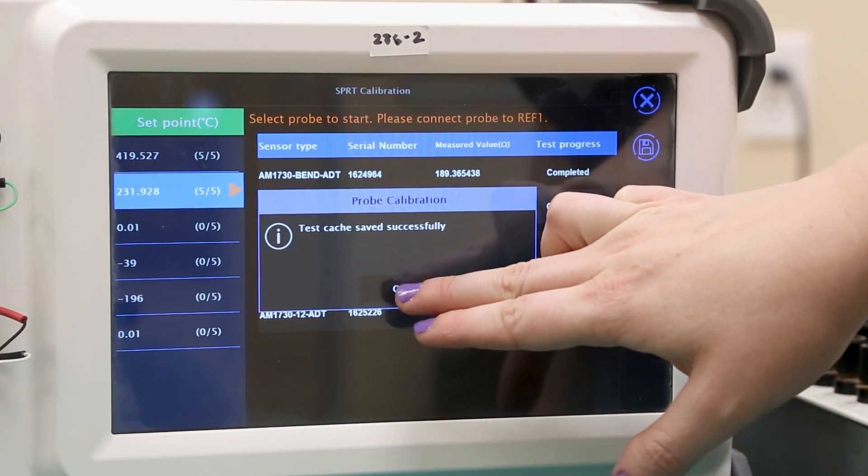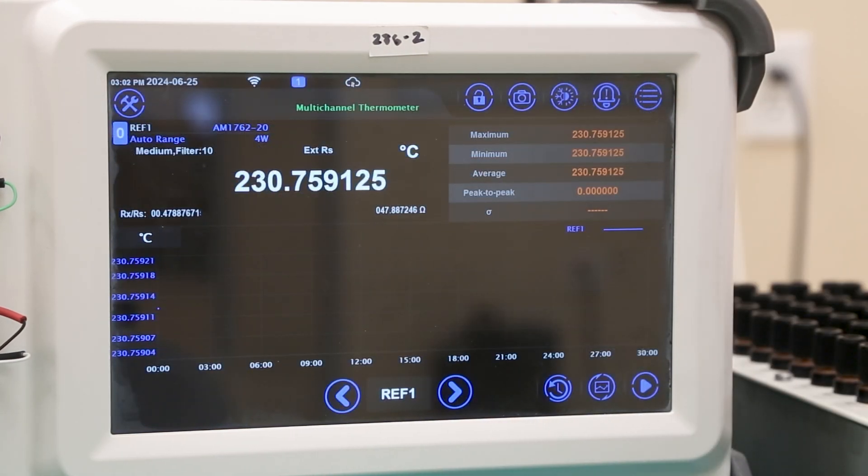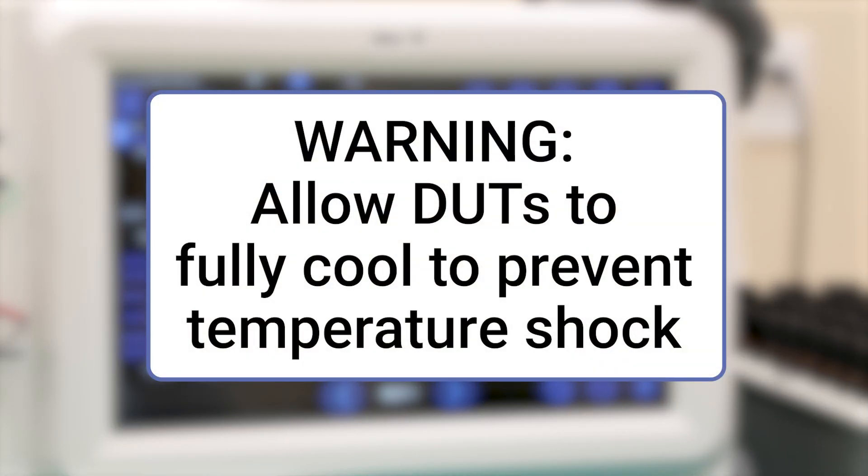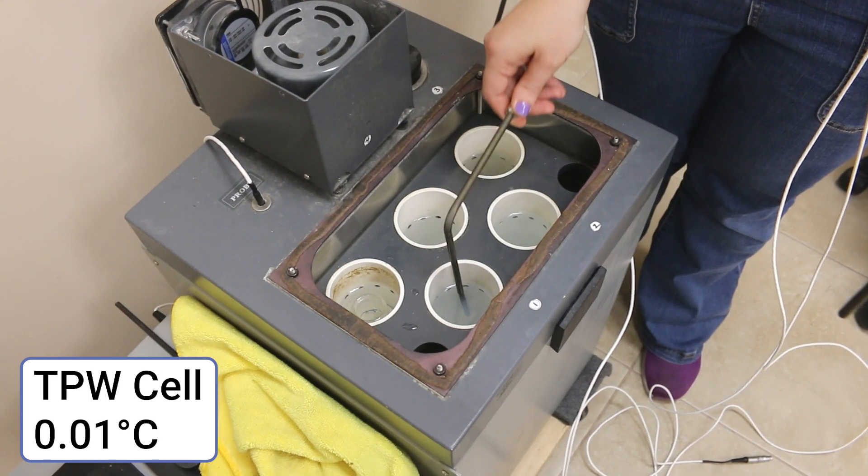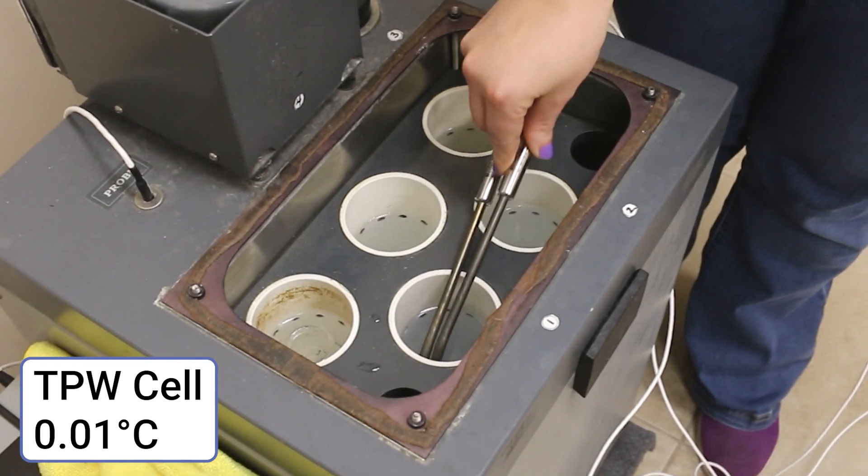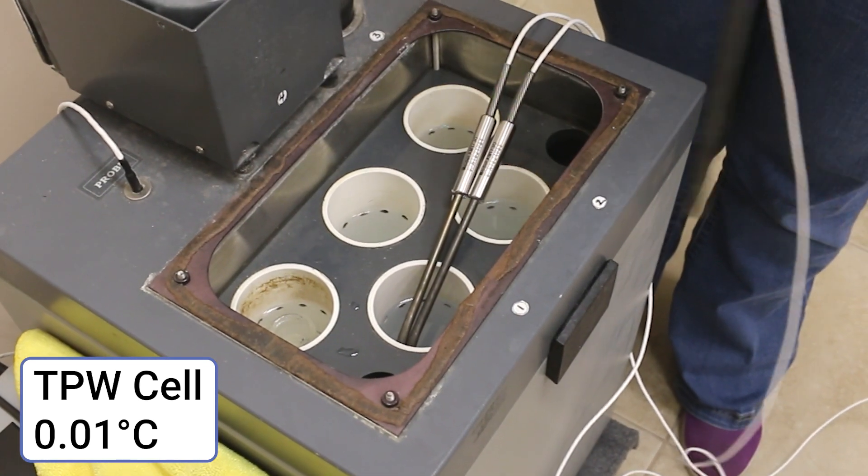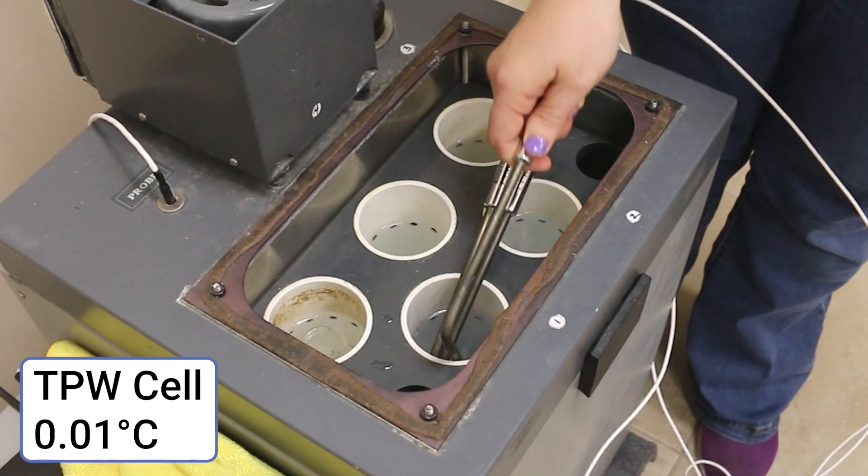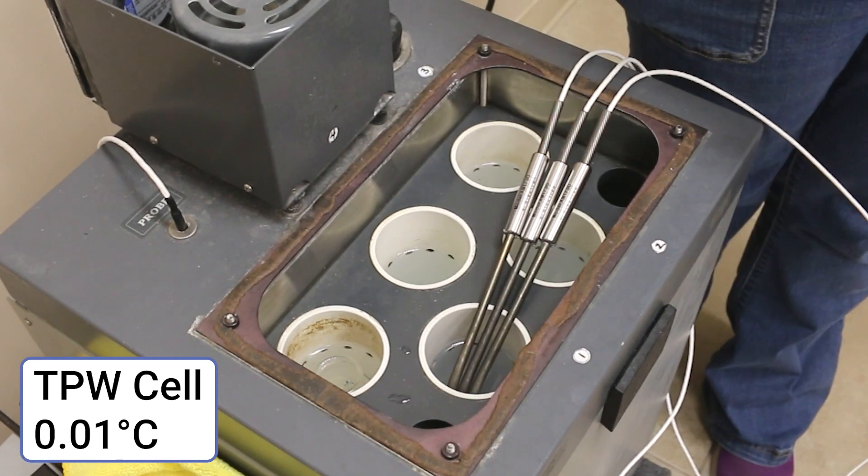Continue measuring probes for the zinc and tin calibration points. Once finished with all five probes, the temperature of each cell should be taken once more with the check standard. Since the next calibration point is the triple point of water with a much lower temperature than the tin freezing point, it's important to allow the probes to fully cool before beginning measurements. Once they have reached room temperature, we will add all five probes to a pre-cooling area in the bath. Since we can confirm the triple point has been reached with the visual inspection of the cell, we don't need a check standard for this calibration point.